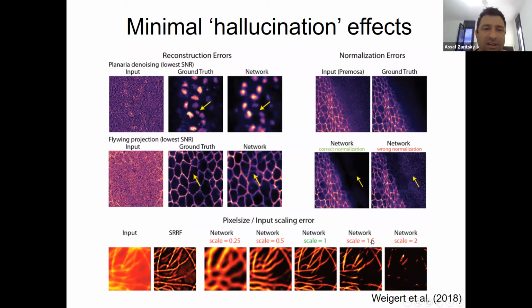The question is what will happen if you take the same area, with just a bit different scope of the image, and try to give it again to the model? You will probably not get the same mistake again. So maybe you can use a kind of composition between a few images of the restored image, if you restore the images.